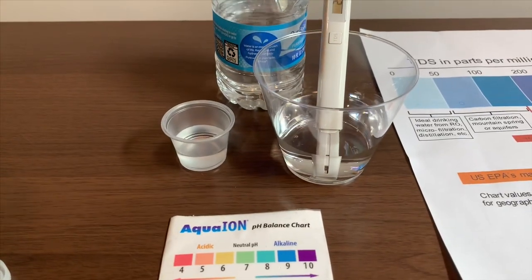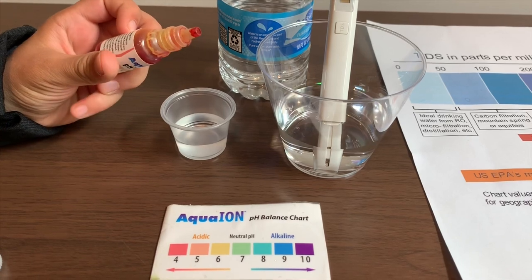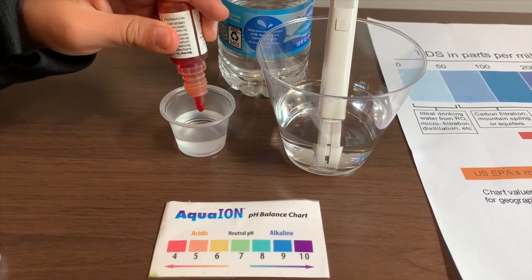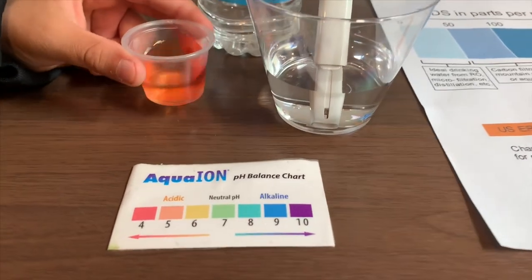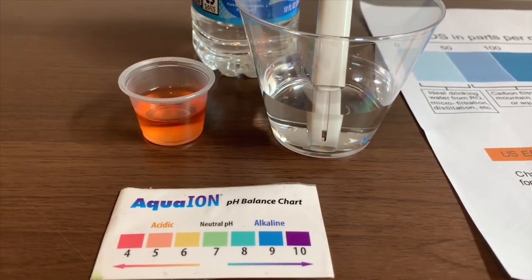Now let's test the pH level. If you want to buy this pH tester, check the link down below. Only do two drops. Let's do it for a better result. I give this a 5 — this is acidic.